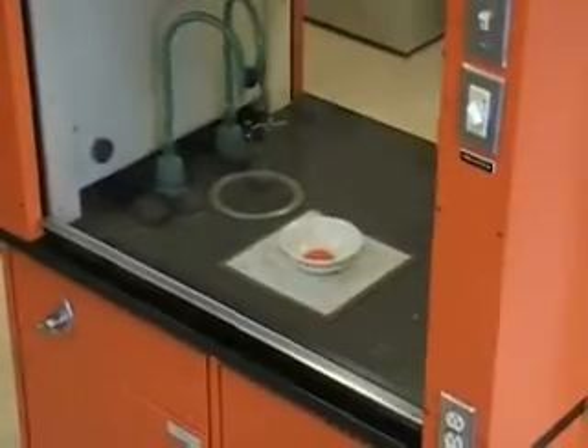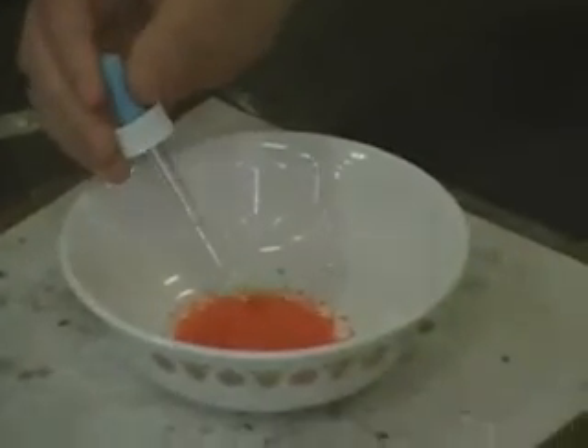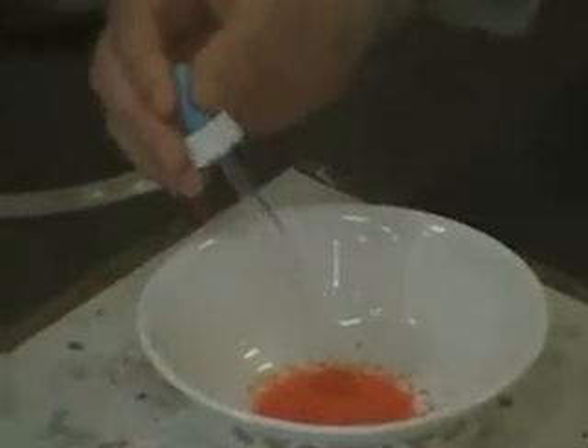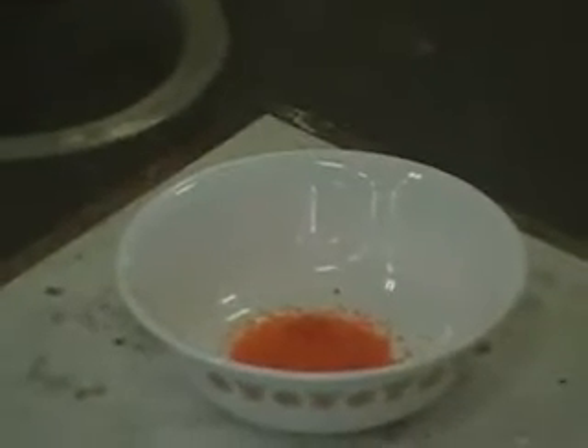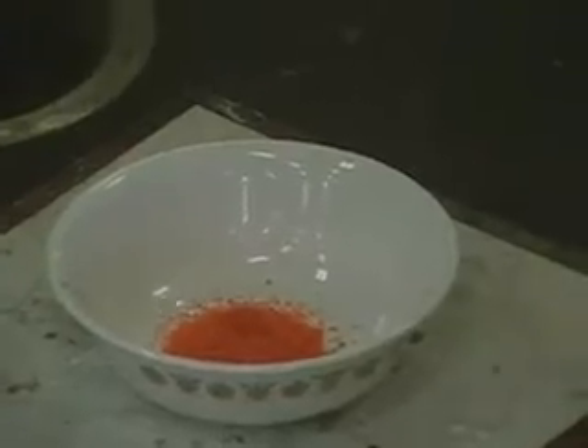I'm going to wet the tip with something flammable just to get it started, and then I'll light it using a splinter, and then it will burn. They often refer to this demonstration as the ammonium dichromate volcano — the reasons for which will become obvious.